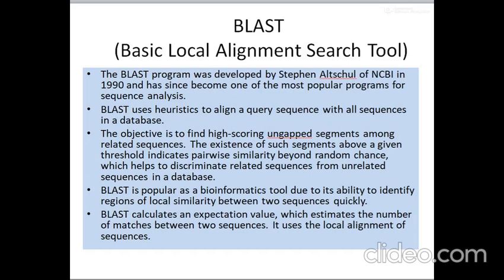It is a popular bioinformatics tool due to its ability to identify regions of local similarity between two sequences very quickly. Here it will also calculate an expectation value, which estimates the number of matches between the two sequences, and it uses a local alignment of sequences.